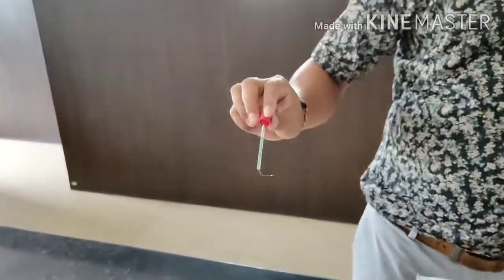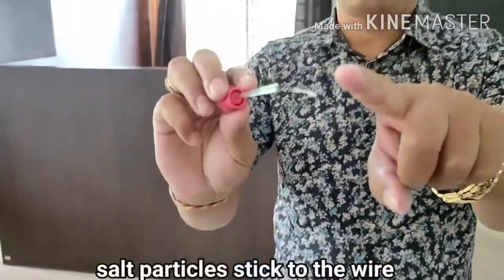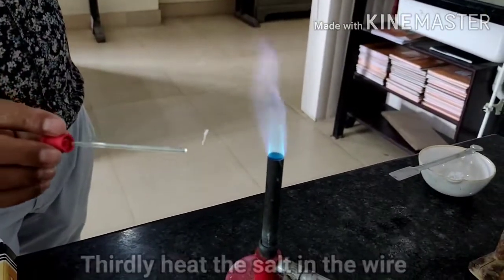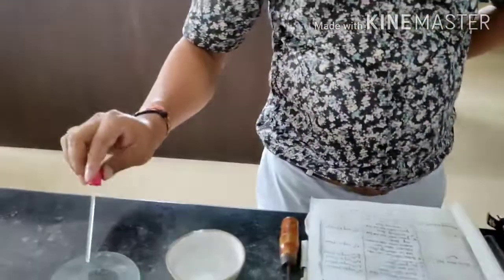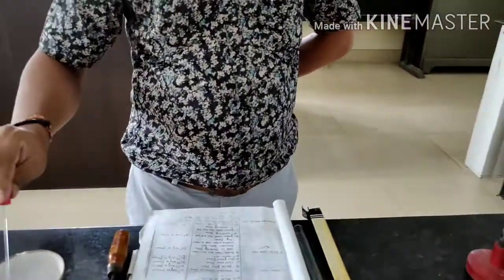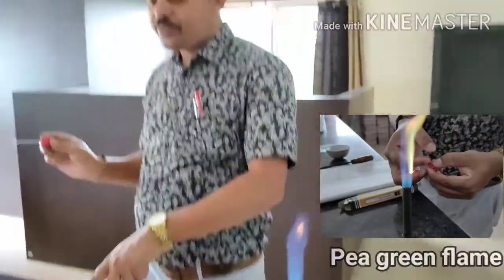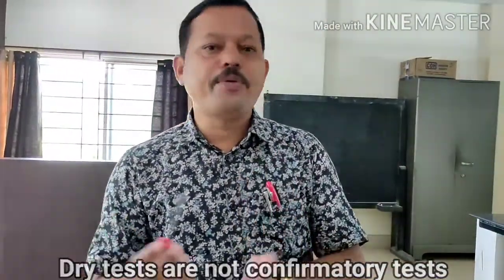After that, you just touch the salt with the wire. Some salt sticks to the wire. Now you heat it and observe the color — what type of color flame you will get. It is like pea green color. Again, just dip in HCl, touch the salt, and see the color of the flame. Observation: flame test gives pea green flame. That means your salt contains Ba2+, I mean barium, as your cation. Since these are dry tests, dry test is not the confirmatory test — barium may be present. This is the process to do the flame test.